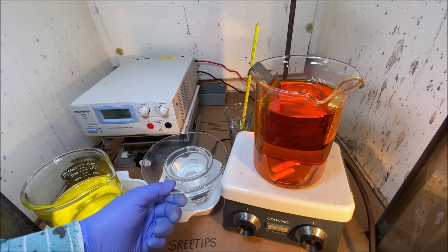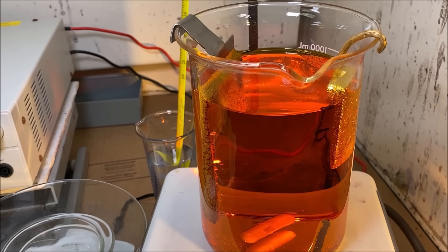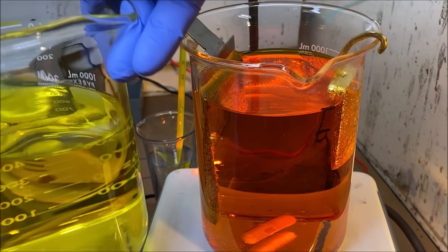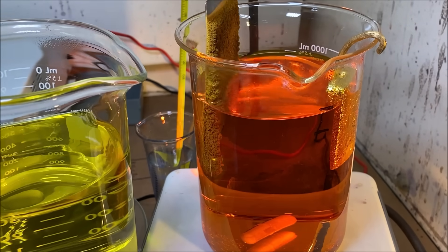Let's get in here and get our cathode out of the cell. Have a look at this — the gold that we've plated out onto the titanium cathode so far.